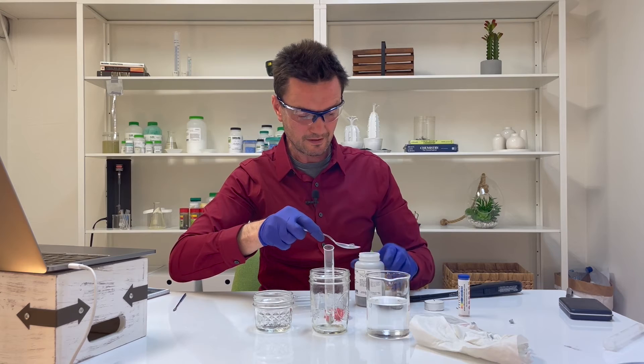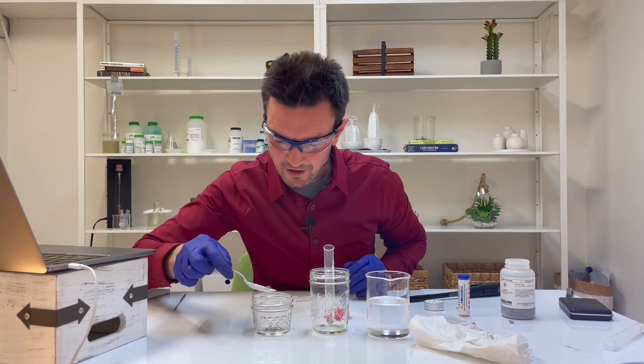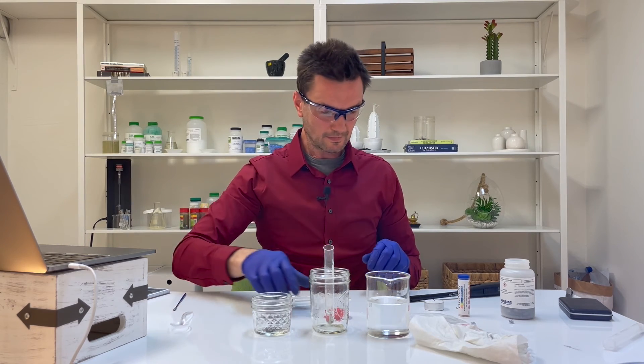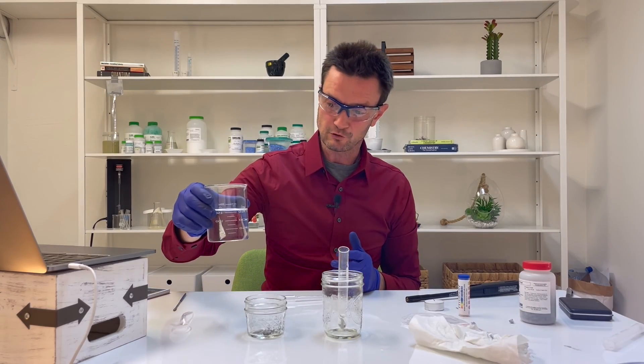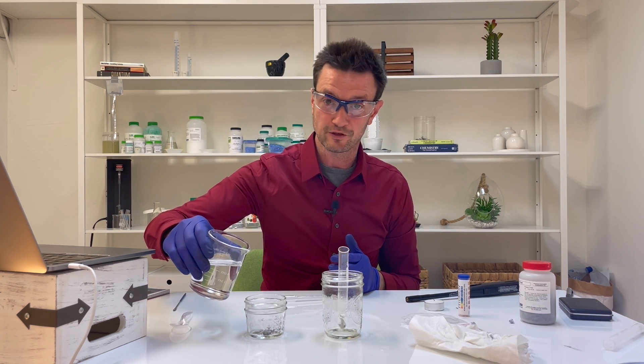I'm going to get just one piece of calcium and drop it into the bottom of my dry glass. I'll put the lid back on the calcium container. When you're ready, take 50 milliliters of water and dump it into the container with the calcium.